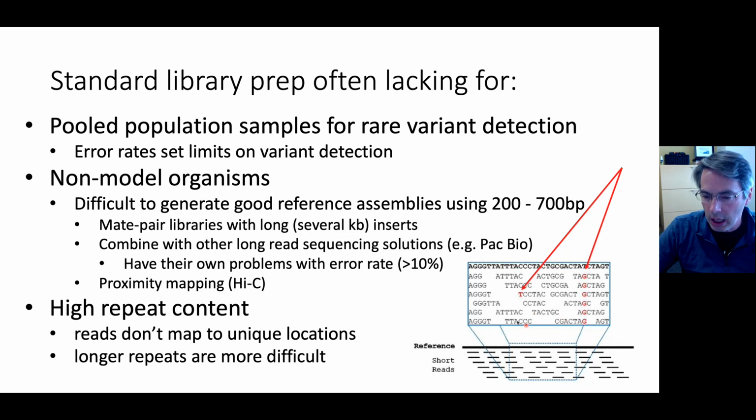If we had 20x coverage on both of these sites, then what would the frequency of T be? If that stays the only one, it becomes more and more likely that it's just an error in the sequencing read. Now, if we go up to 20x coverage and now we start to pick up 3, 4, 5 T's, now you start to say, okay, actually, that's probably a heterozygous site.